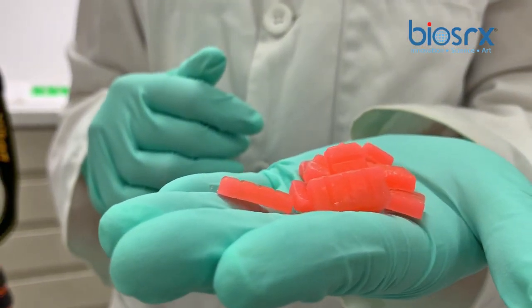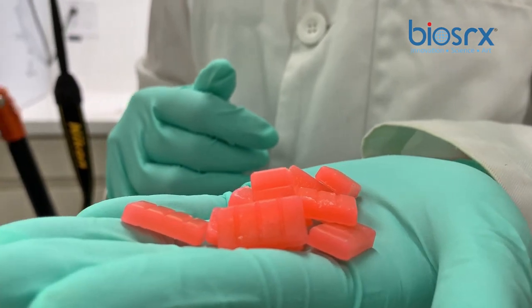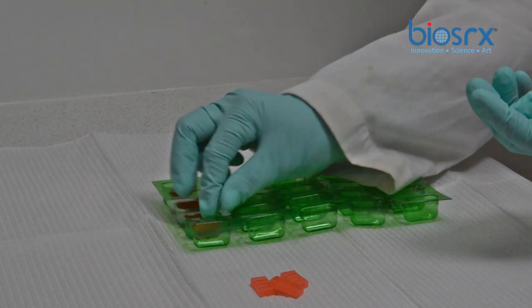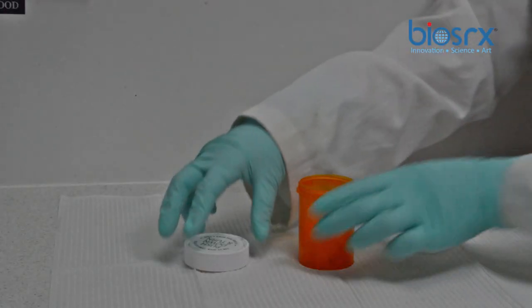Another advantage of RD trochee molds is having the ability to package trochees in a variety of packaging options, such as blister packs or child-resistant vials.